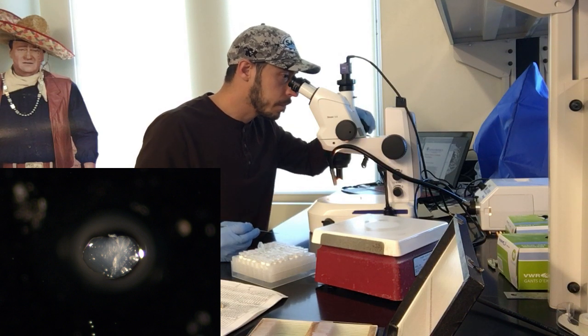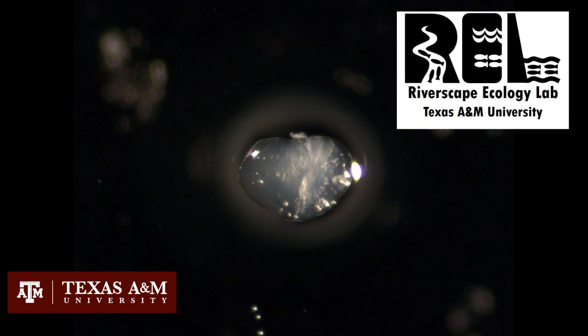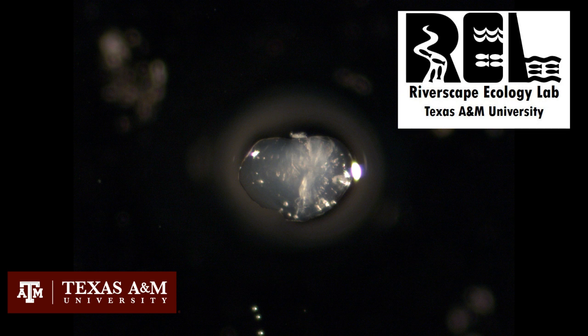That's the orientation it should be in as well. You want the sulcus or the core on the back side of the slide, exposing the front end of the otolith — this is the side that you're going to end up polishing. There are several options for polishing. A lot of people will create a slurry with a fine grit silicon carbide, put that on a high grit polishing pad, and polish from there very slowly. But that's for a different video. In this particular video, I showed you how to extract and mount otoliths for the next step, which would be the polishing. Thanks for taking the time to watch, and best of luck in your endeavors of extracting otoliths from small fish.